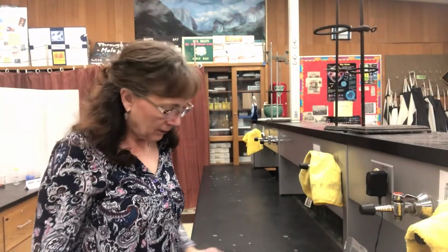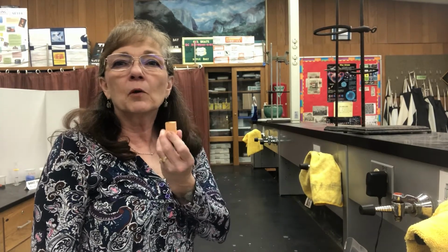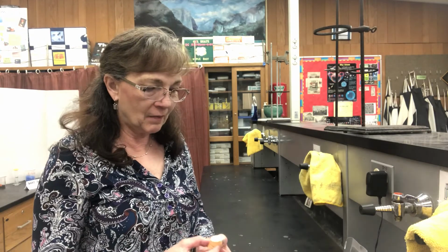Hi guys. I wanted to come in and do an experiment for you that you normally would have done yourselves, and that is learn about molar mass by writing your name with sidewalk chalk on the sidewalk outside. I'm going to do it in here on the lab bench and hopefully it works out okay.